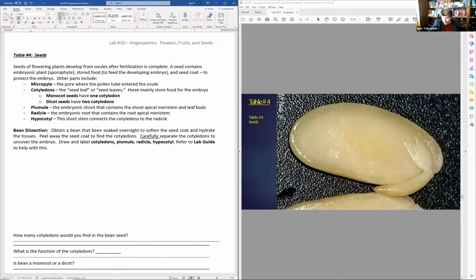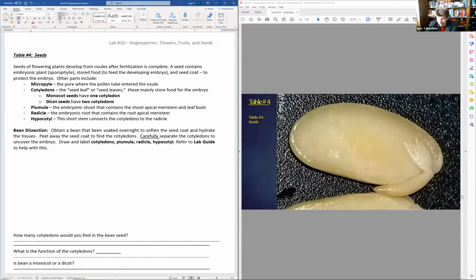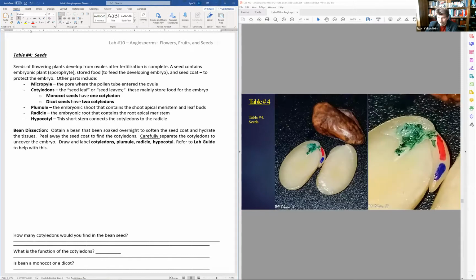The things which will turn into the actual leaves, then the stem, and then of course the embryonic root. And that's basically plumule, radicle, and hypocotyl. I think, yeah, here we go. I did a really good job hand painting those ones for you. The green part right here, the leafy part, is known as the plumule.